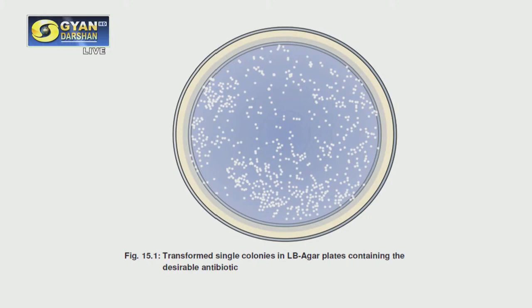So these were the three main experiments that we discussed today. If I recap once more what we actually learned today: if you take the two sessions, last session and today's session together, it makes a complete story. First you learned how to isolate plasmid DNA. Next you learned how to check the plasmid DNA through an agarose gel, that is agarose gel electrophoresis. Then you learned how to quantify the nucleic acid, that is, the concentration of the DNA, and whether the DNA is pure. Because I told you that we measured the OD260 by OD280 ratio, and that is how we check the purity of the DNA.